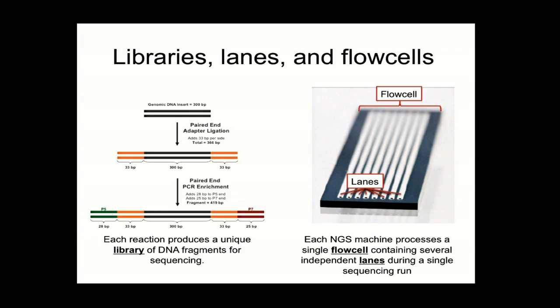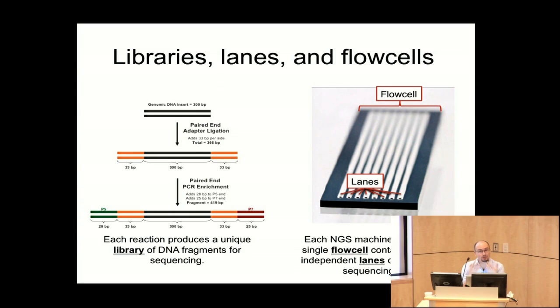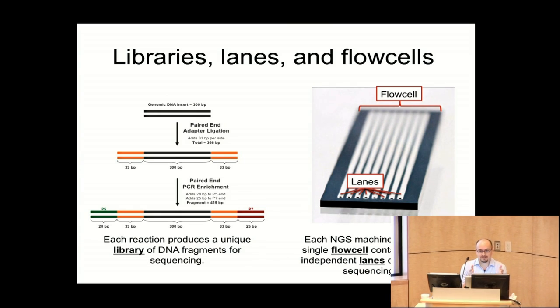So this is an example of a paired end library prep. It's producing a library of DNA molecules. So, this is really the sequencing unit. I mean, you are putting a library of molecules onto a machine and sequencing it. So the example is, if I have 1 million molecules in my library, I don't know, maybe I diluted it down, I can only sequence 1 million unique fragments from that library, no matter how many reads I happen to get. They start to sequence the same molecule.